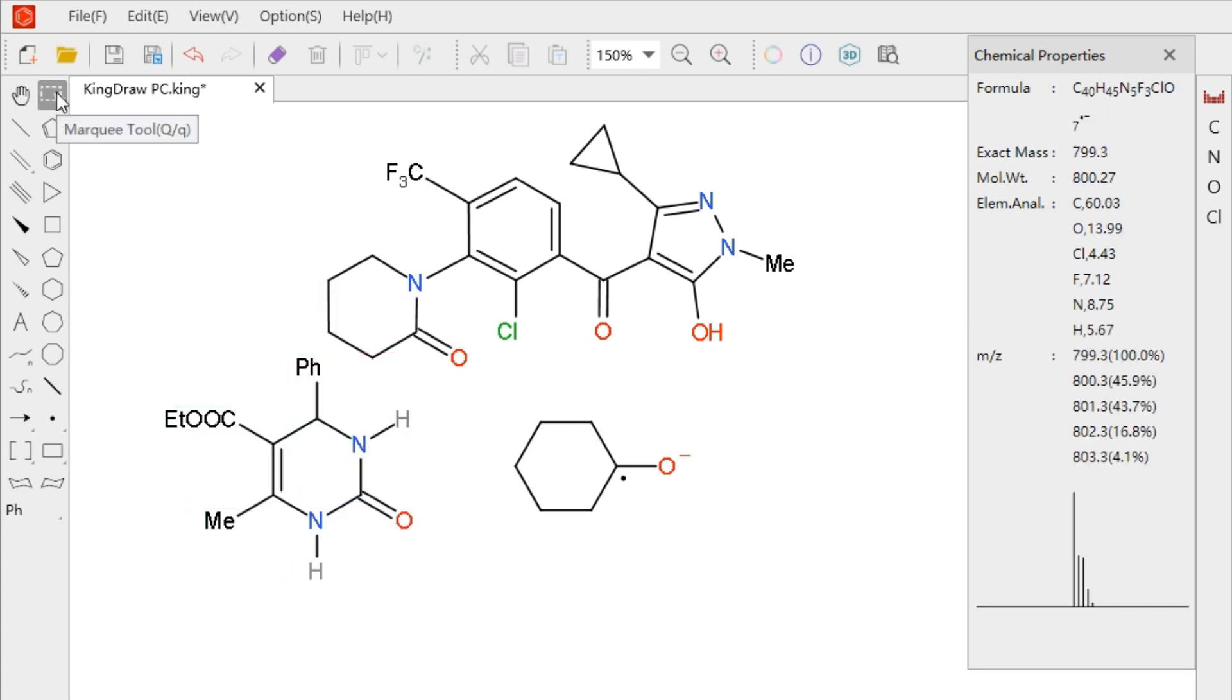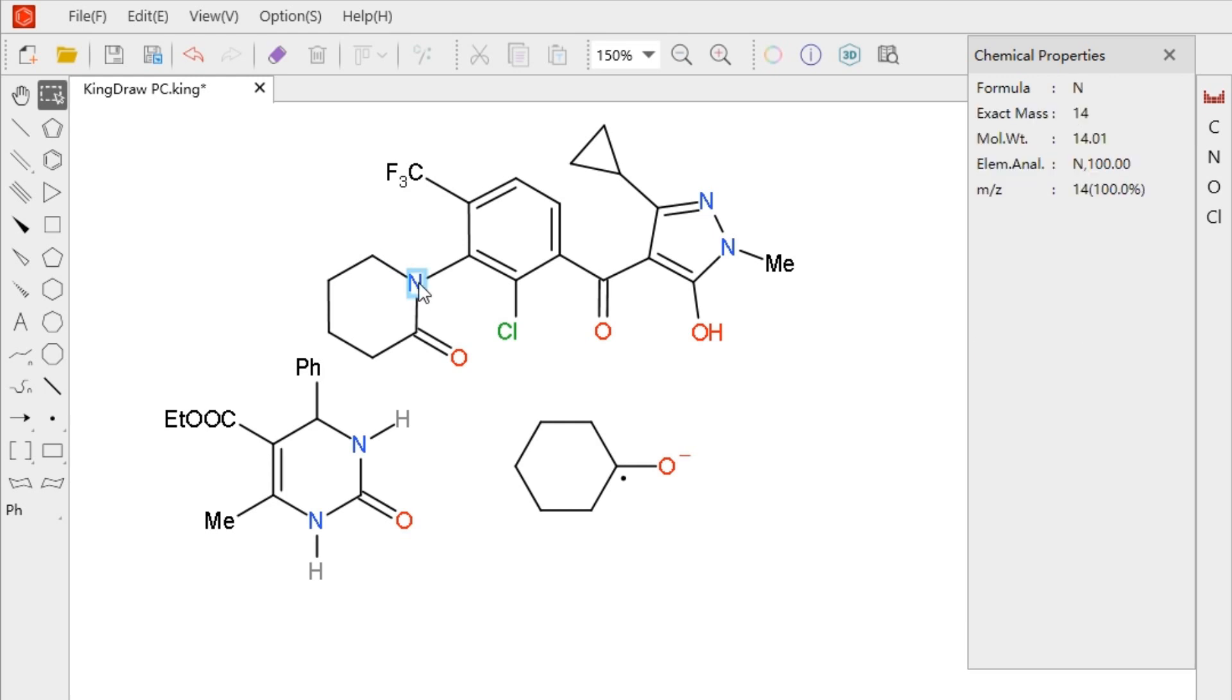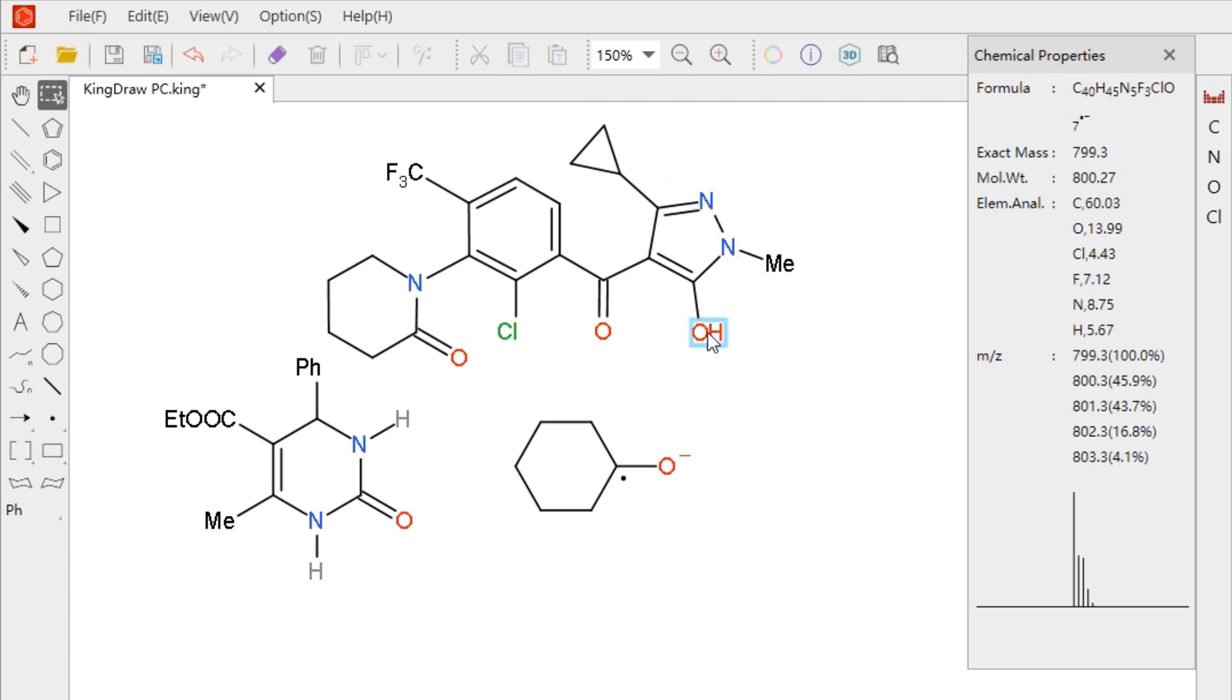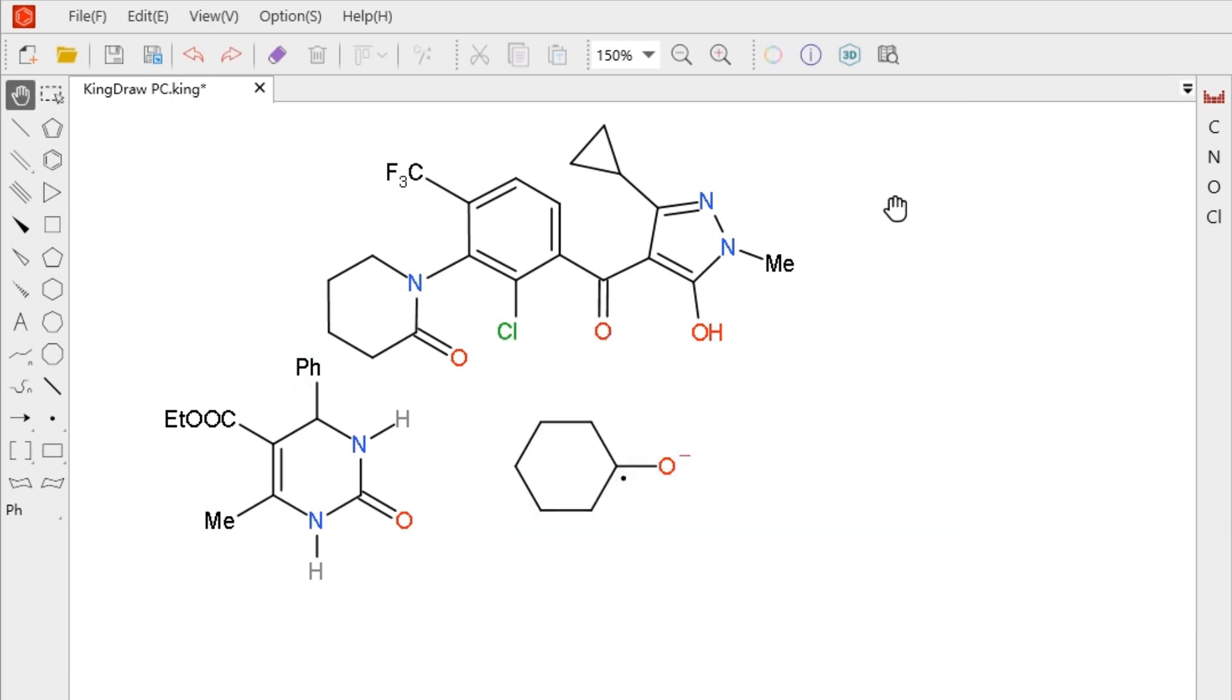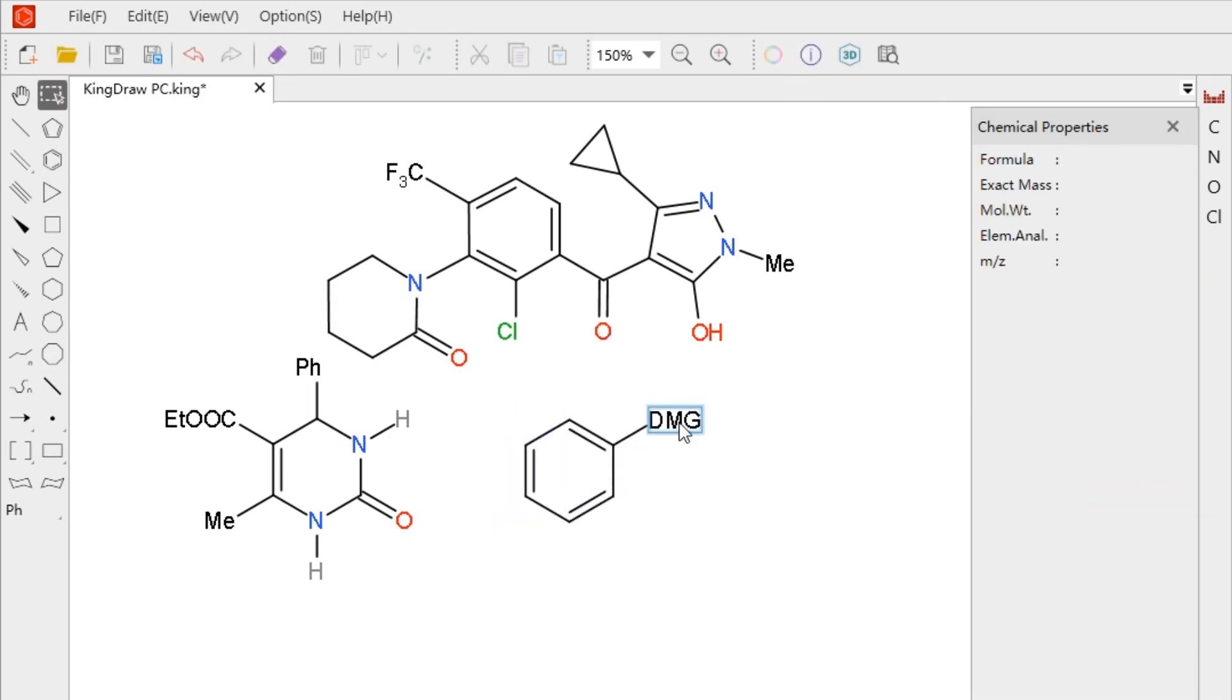In this tool, the system can automatically identify the chemical properties of the elements we draw, such as bonds, rings, acyclic chains, snaking chains, groups, charges, radicals, and polymers. For the text input group, the chemical properties cannot be recognized temporarily.